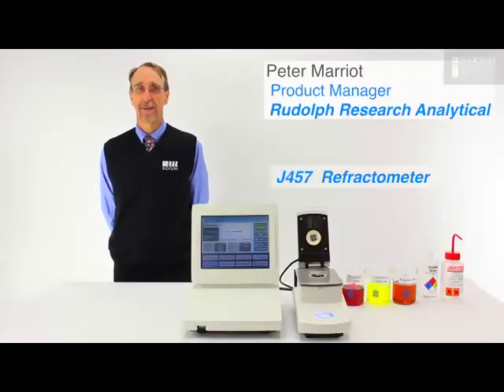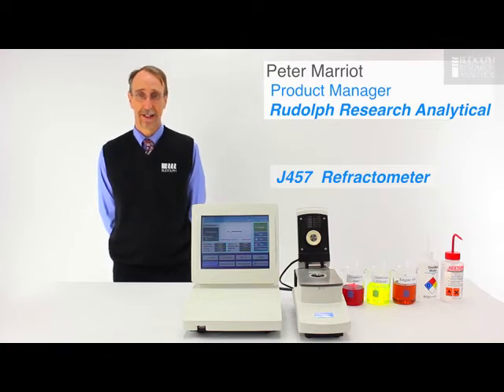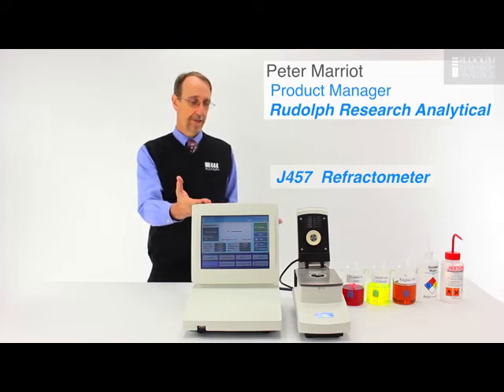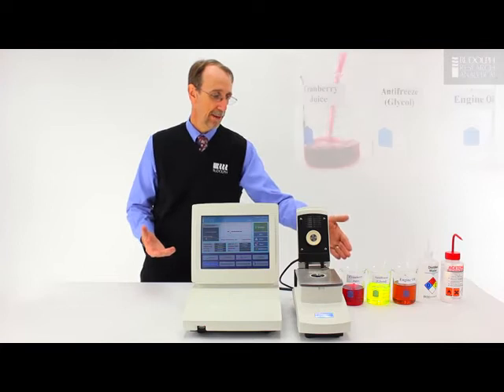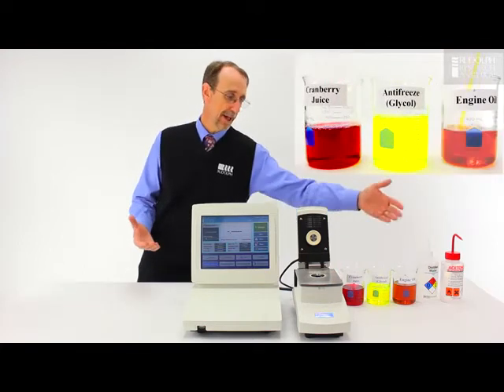Today we're going to perform a quick experiment. We're going to look at the effects of changing temperature on refractive index. To do this test I have a Rudolph J457 refractometer and I have four different types of sample: water, cranberry juice, ethylene glycol or antifreeze, and engine oil.